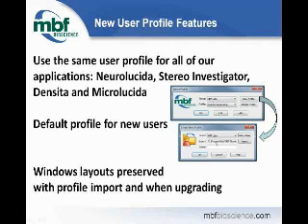What this will buy you, if you're running a facility, when you add a new user to your system, they can begin working without needing to configure the hardware or calibrating the lenses. You just give them the default profile, and they'll be able to start working.